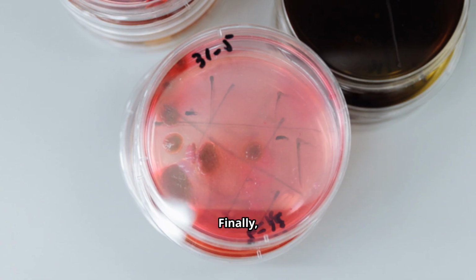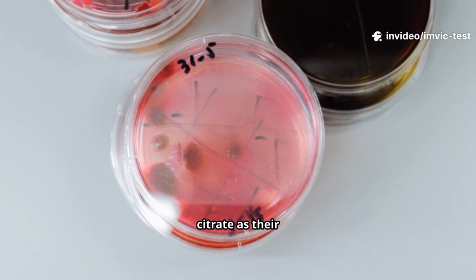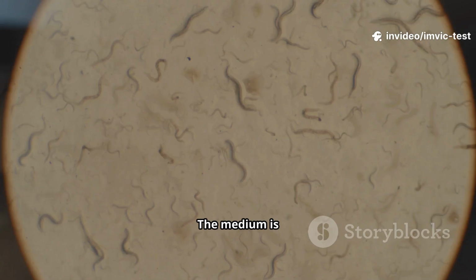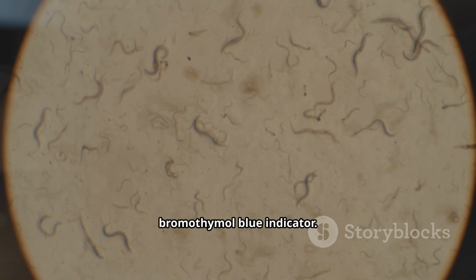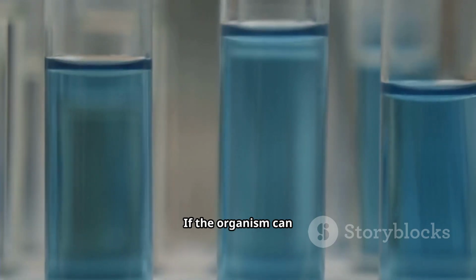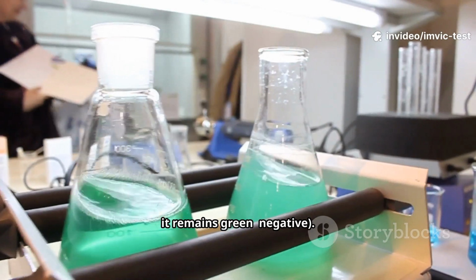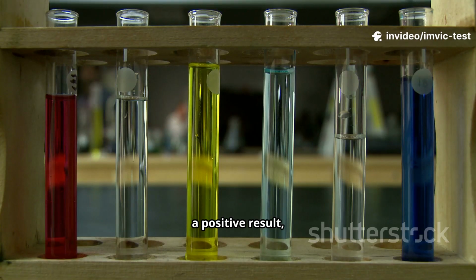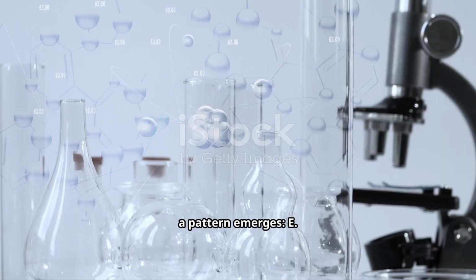Finally, the citrate utilization test determines whether the bacteria can use citrate as their sole carbon source. The medium is Simmons citrate agar, which contains citrate and bromothymol blue indicator. If the organism can use citrate, the medium turns blue, positive. If not, it remains green, negative. Enterobacter gives a positive result, while E. coli is negative.